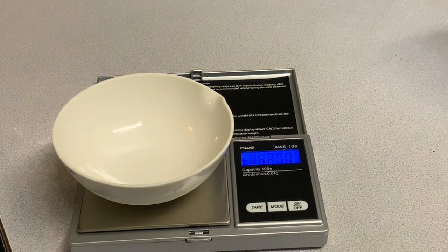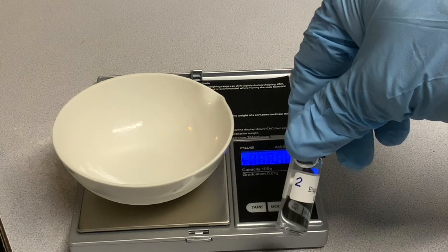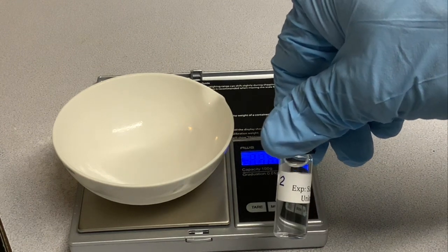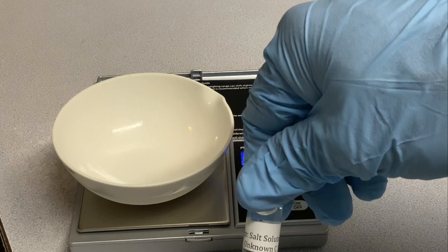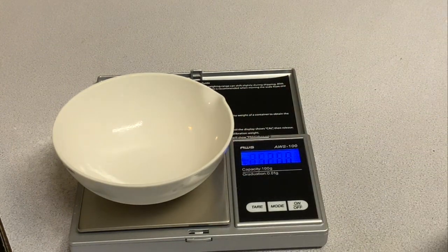Next, I'm going to do the experiment again, this time with the vial that I just labeled 2. That way I don't mix it up. Okay, this will be trial 2. It's the same unknown. It should give me the same result.